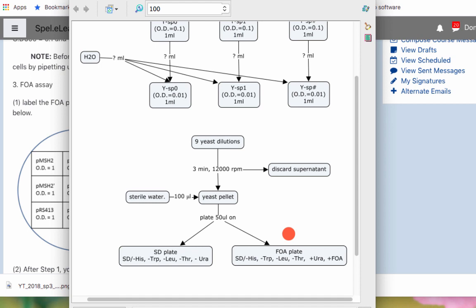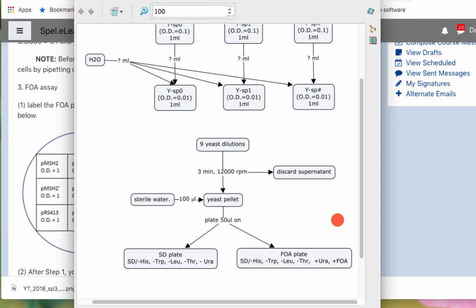And the reason that we're plating this yeast at 3 different dilutions, 1, 0.1, and 0.01, is so that we have a range to capture the optimum density that will allow us to tell the difference in growth pattern between the 3 yeast strains. What you measure in the end in this experiment is the dependent variable. Okay, so what does it represent?